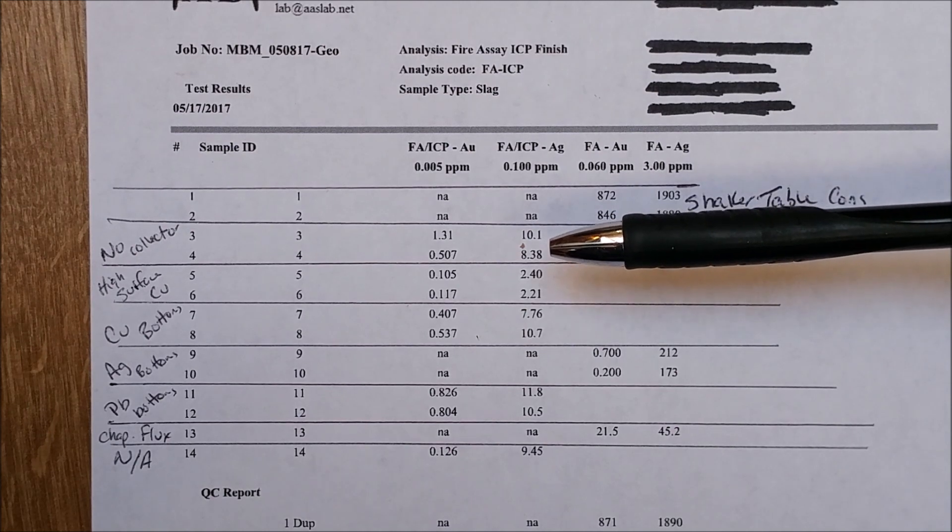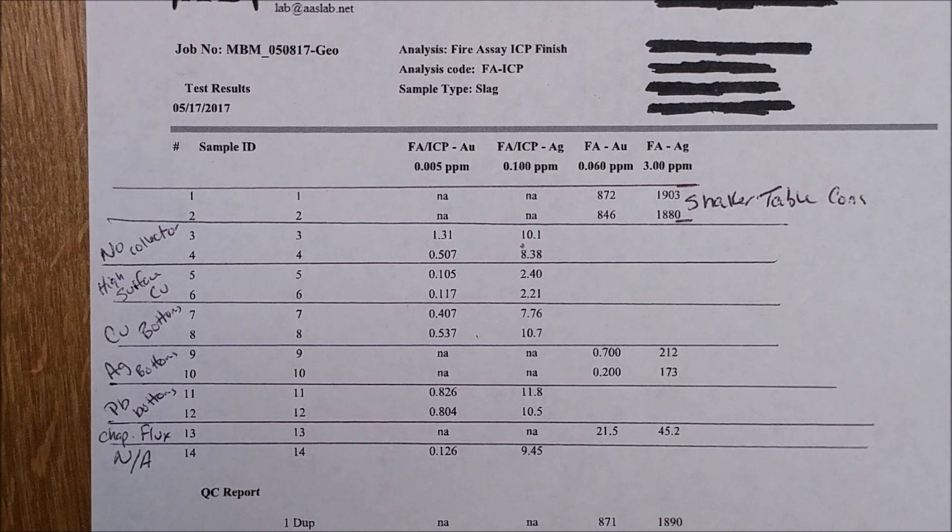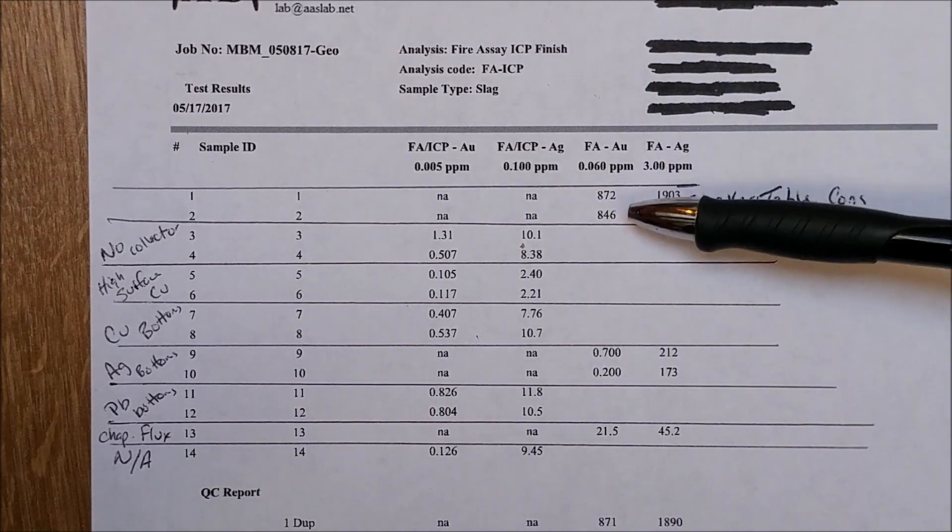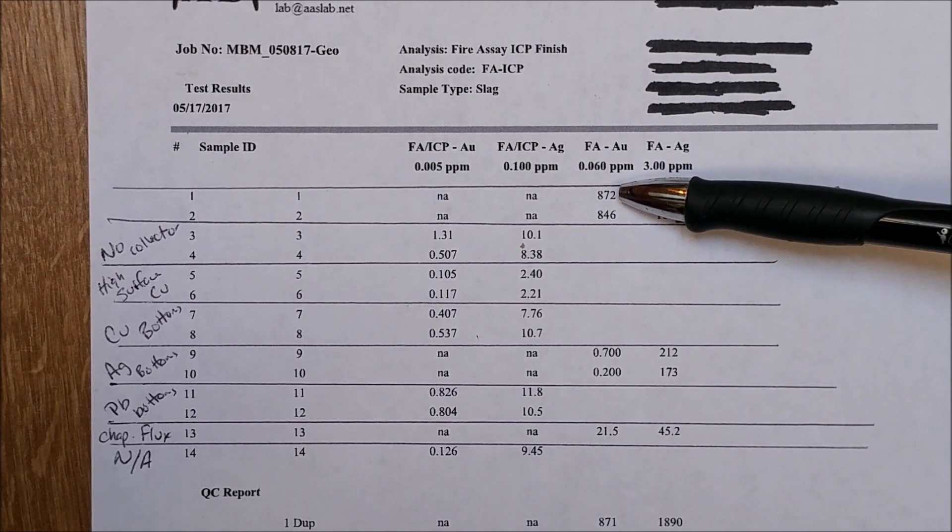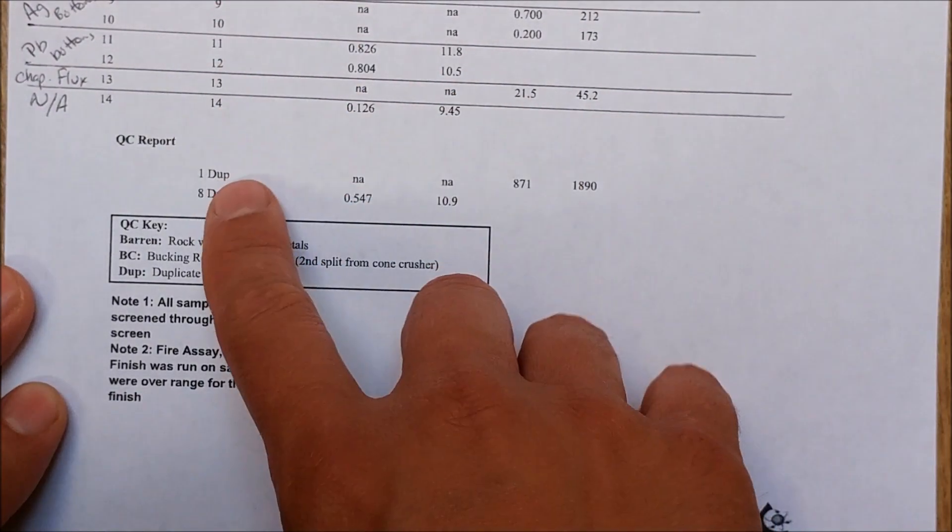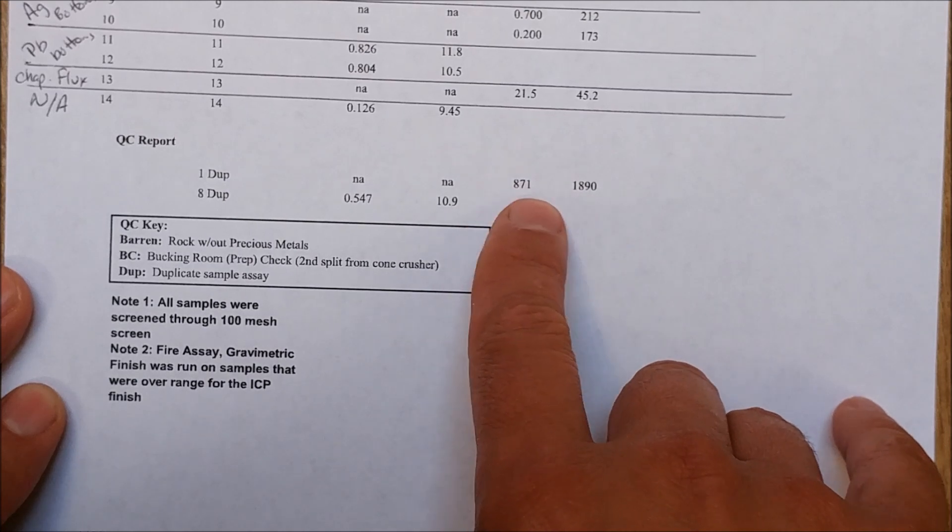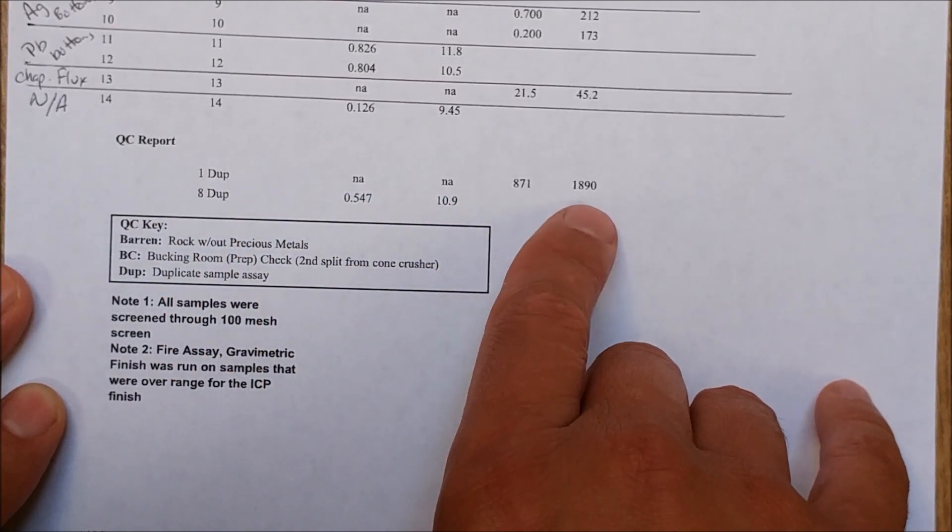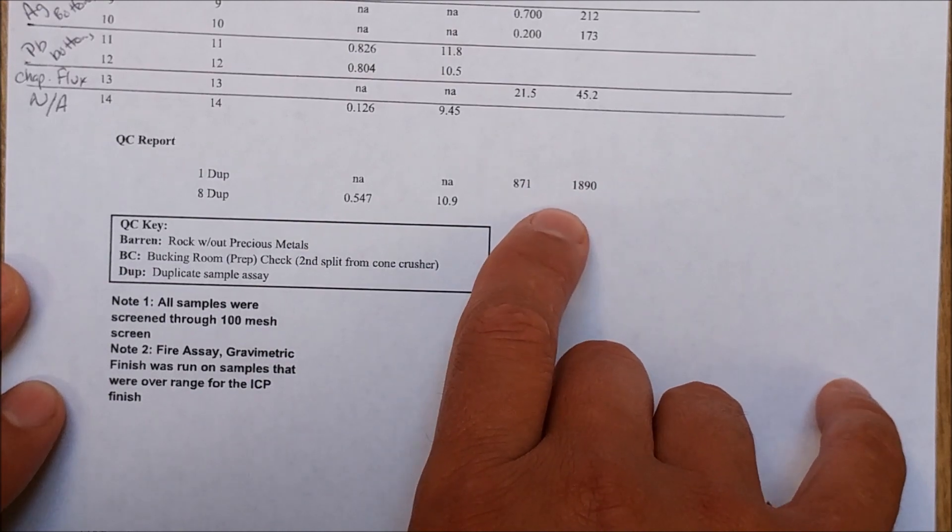And these are in parts per million, which I believe equates to grams per ton. We can have some lively discussion in the comment section about if parts per million is equal to grams per ton, even though it doesn't take into consideration the density of the thing you're measuring. It's just a counting technique essentially. But anyway, that's how I did it. I equated these all to essentially grams per ton. So the shaker table concentrates, we ended up with the first one was 872 grams per ton and the second one was 846. So I took these numbers, and I will show you a calculation by how I went from grams per ton to percent recovery. And one more thing I'll point out here is they actually ran a couple of duplicates for me. So this will be important in our next calculation. I'm going to average three of the numbers together. This is a duplicate of the shaker table concentrates, so I'm going to average these numbers in with the first two to get the average amount of gold in our sample we started with.